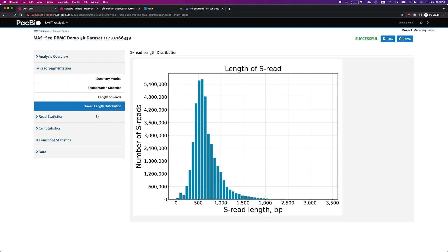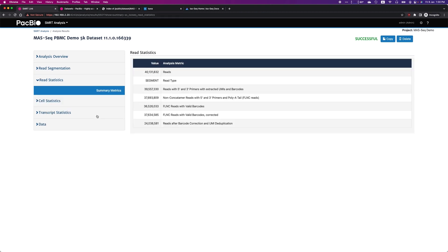If you go to read statistics, this tells us that 37 million reads out of the 40 million reads, S-reads, contain valid cell barcodes, primers, and poly A tail, showing the advantage of accurate HiFi reads.